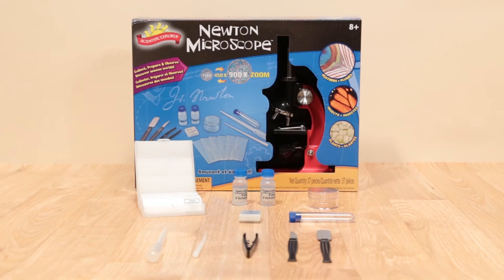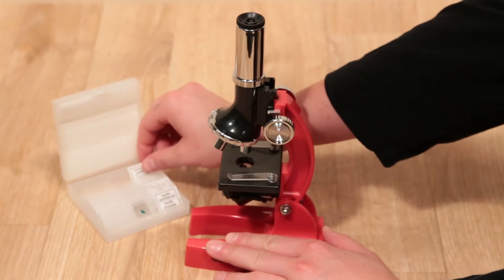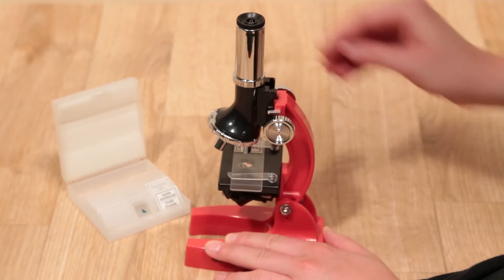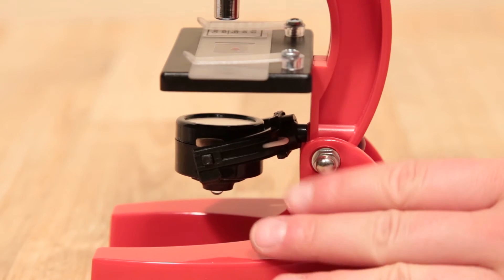Just set your microscope on a flat surface, place one of the prepared slides under the clips on the top of the stage, and use the mirror to reflect light into your specimen.